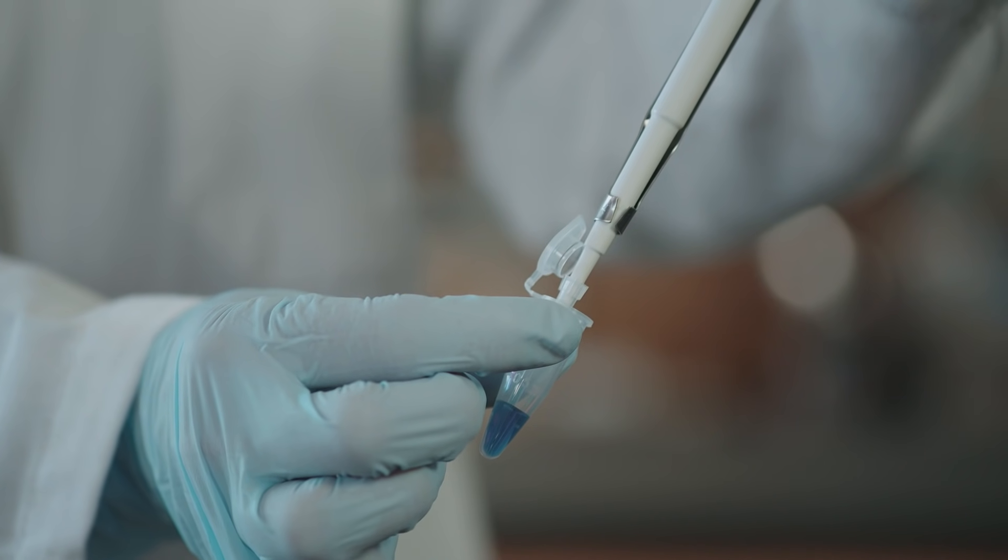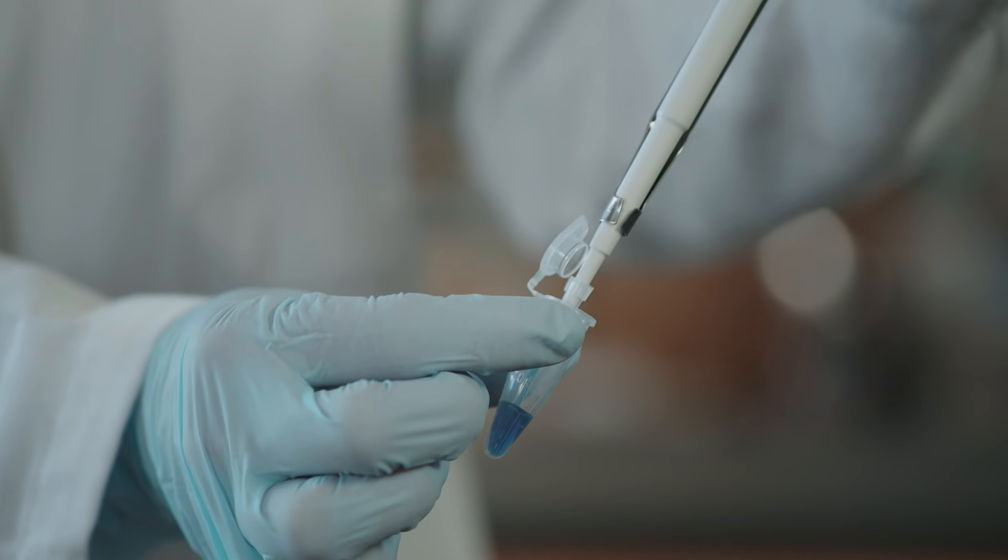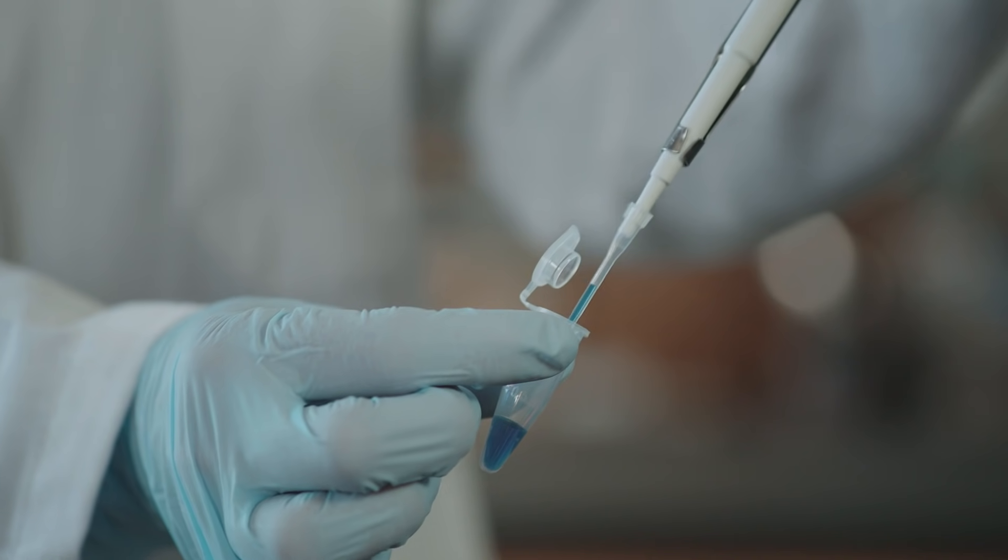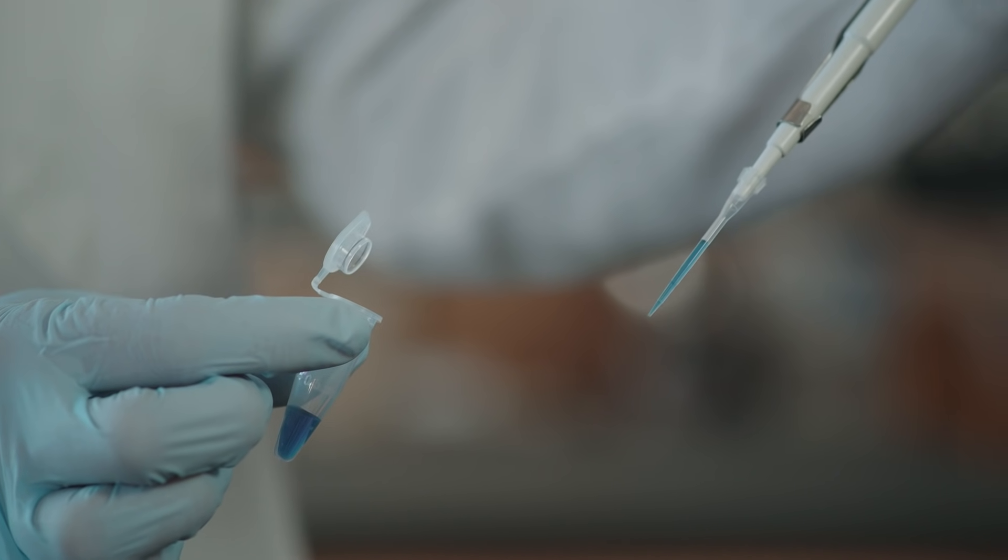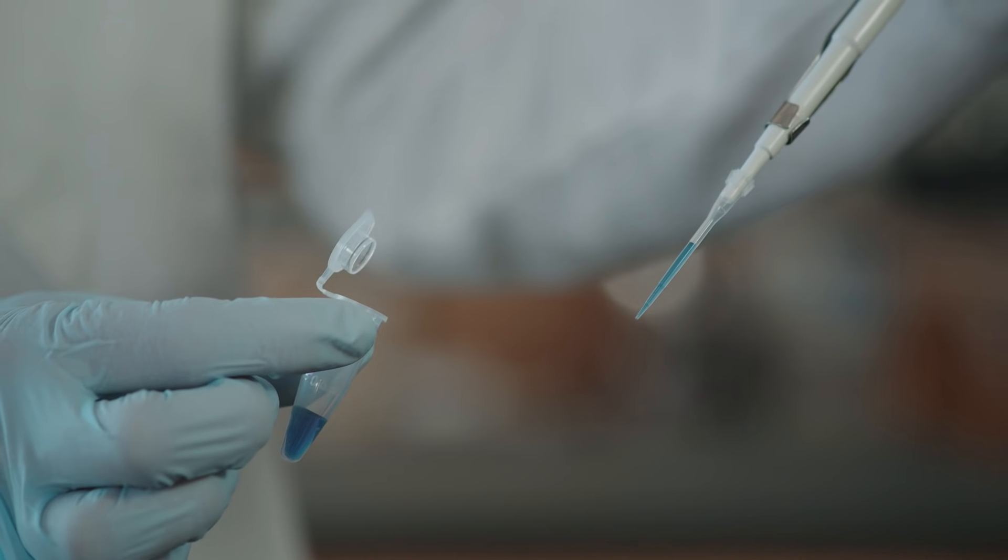Draw the tip out of the fluid in the micro centrifuge tube. The micro pipette was set for 20 microliters, so the volume of fluid taken up into the pipette tip is 20 microliters.